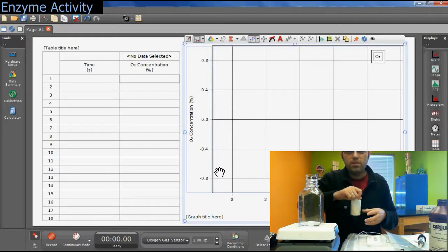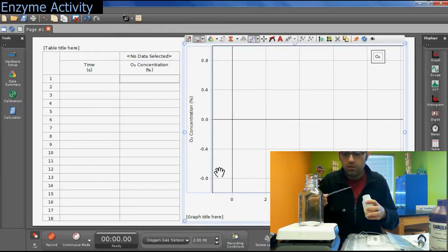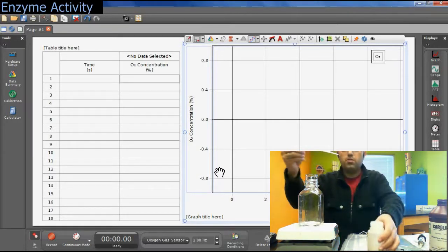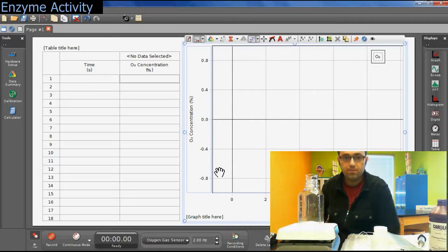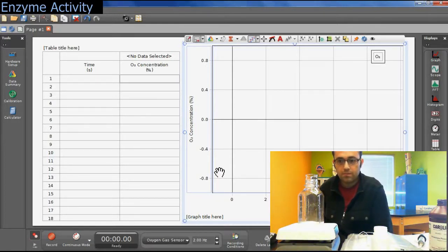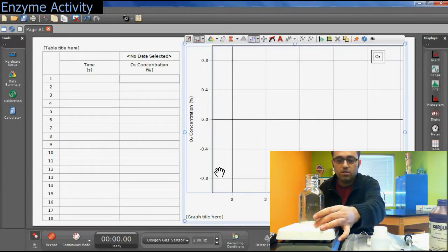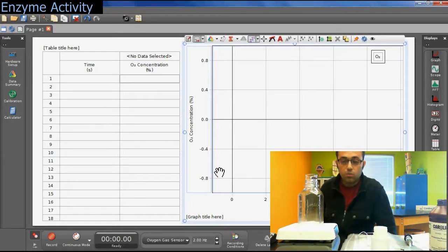Get your yeast sample and mix it well before placing it in the container, because since it's a suspension you want to make sure it's evenly distributed. The yeast cells should be evenly distributed in the suspension. You're going to measure out 0.5 mL of yeast suspension, place it in the container, and wait for one minute to mix it up. After one minute, you can seal the container with the oxygen sensor, making sure the yeast cells are evenly distributed within the hydrogen peroxide solution.